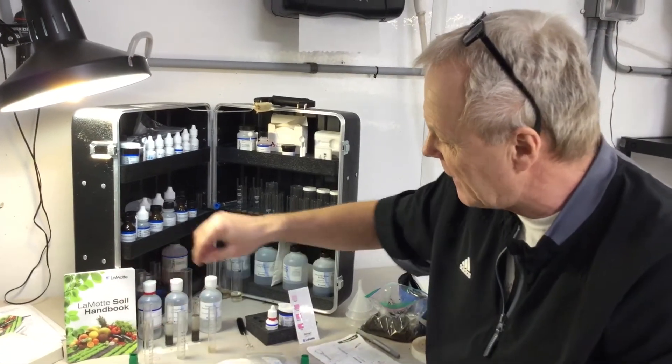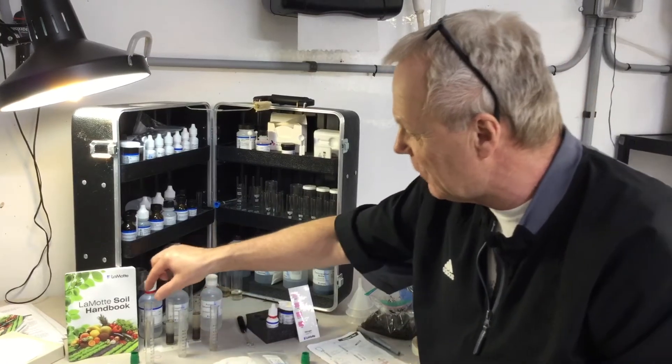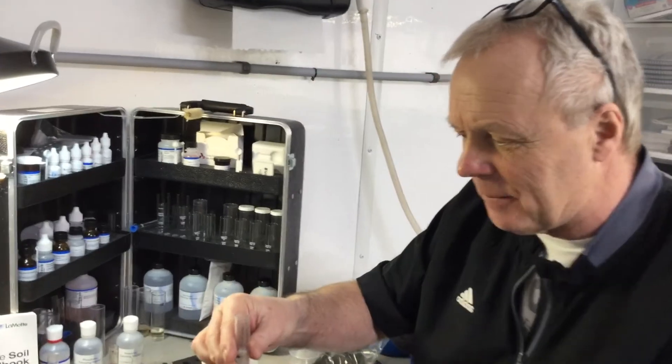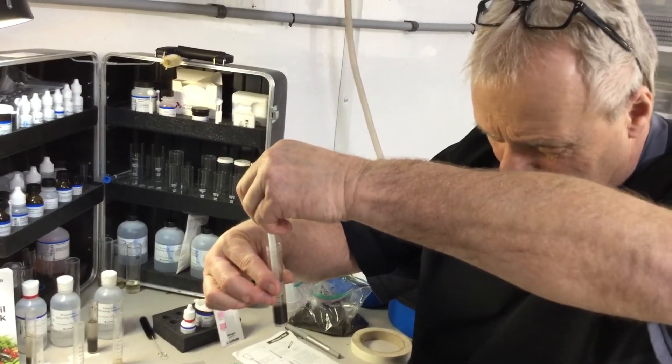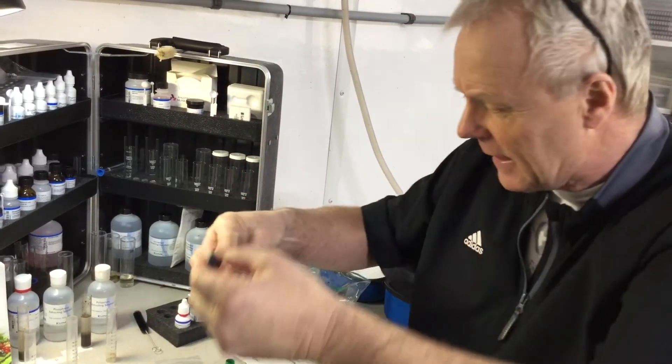And then we have to get to line four here. So when we come back, we're just going to simply take this. Here is our phosphorus — we don't want to shake it up at all. I squeeze my pipette first, put that in, and then draw that up.